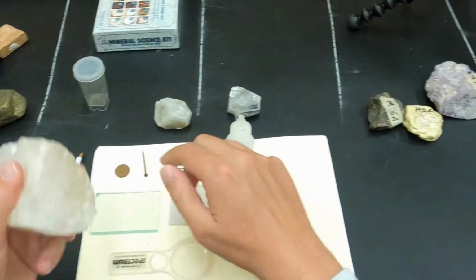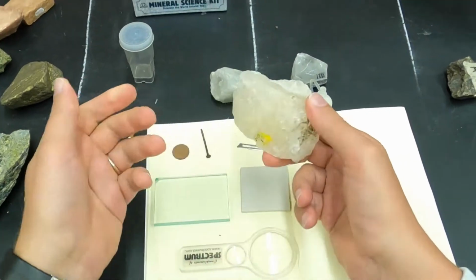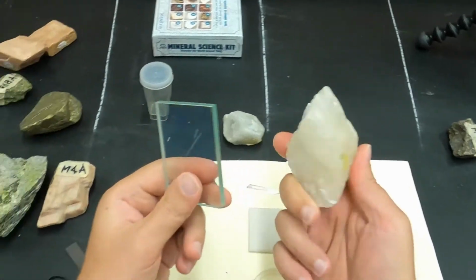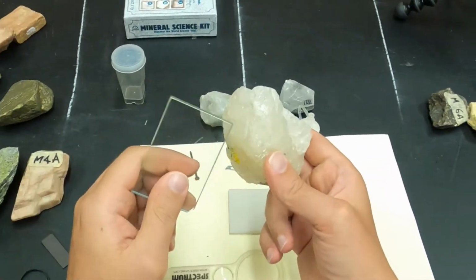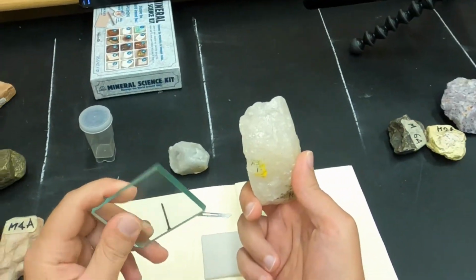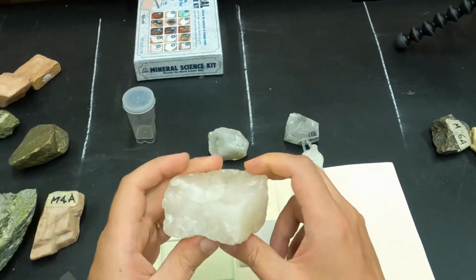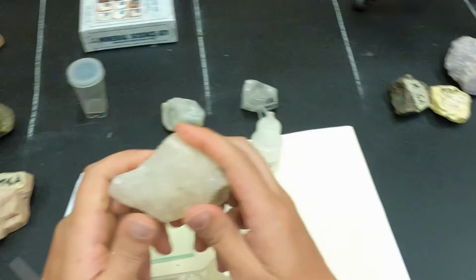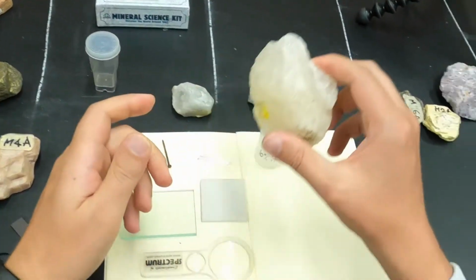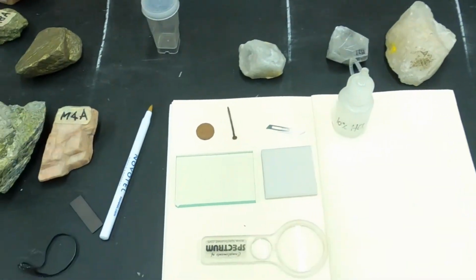In this example, we are talking about a mineral called quartz. It's essentially silica. It has the same composition as this glass, but the structure is different. This is ordered, this is unordered or amorphous, and that's why you have a difference in hardness. This is far harder, around 7, which is again part of the Mohs scale. And so we have reviewed the main tools for testing for hardness.